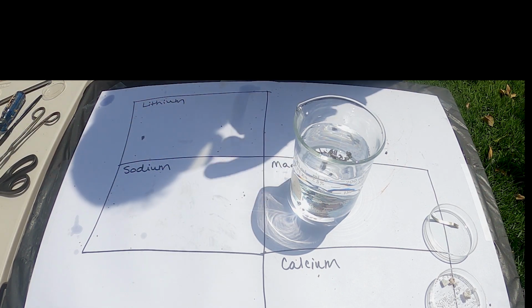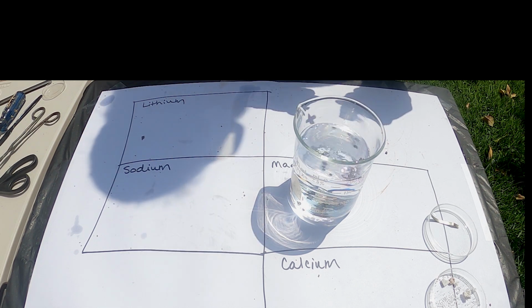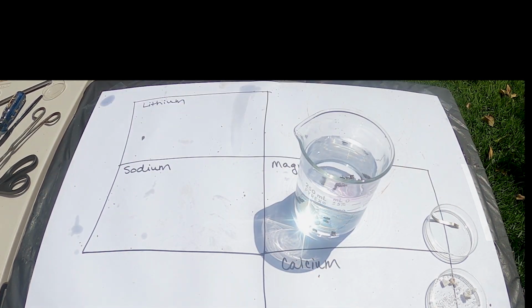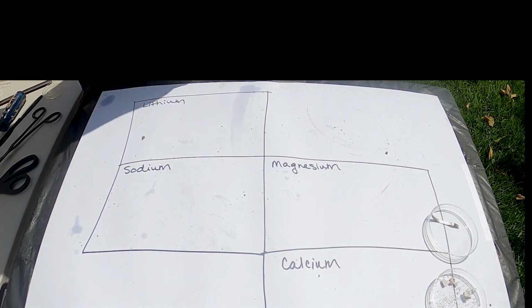Let's add in the phenolphthalein and see if there is a sign of a chemical reaction. And no pink. What that tells me is that the magnesium is not reacting with the water. I'm not making the metal hydroxide. A metal with water should produce a metal hydroxide, so if I'm not getting the pink, then there must have been no reaction. So that's our magnesium's chemical properties.